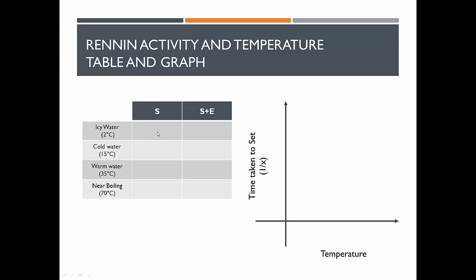Probably not. Maybe. I don't think so. But we're having this just to make sure that it is only the enzyme that's affecting the ability to curdle. So this one, I think, will just stay the same. It'll just stay milky.